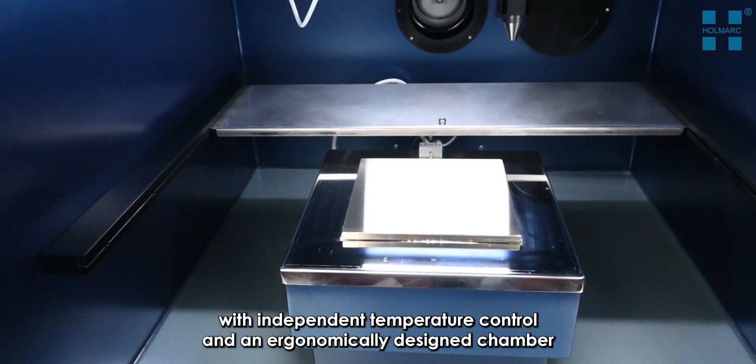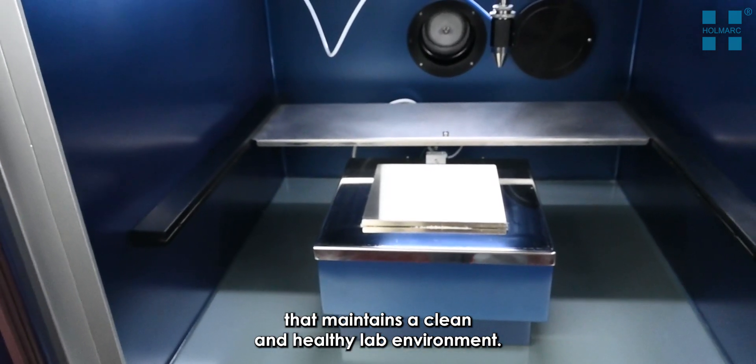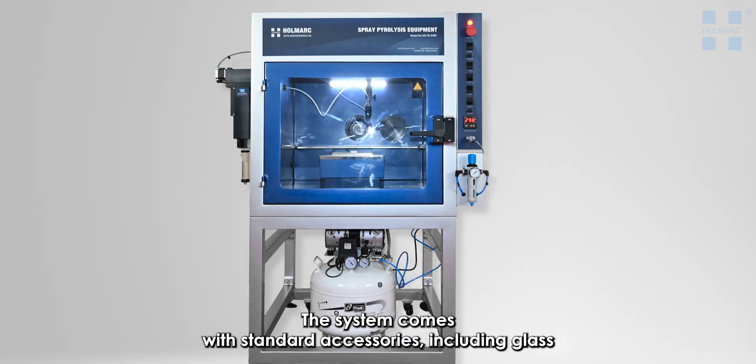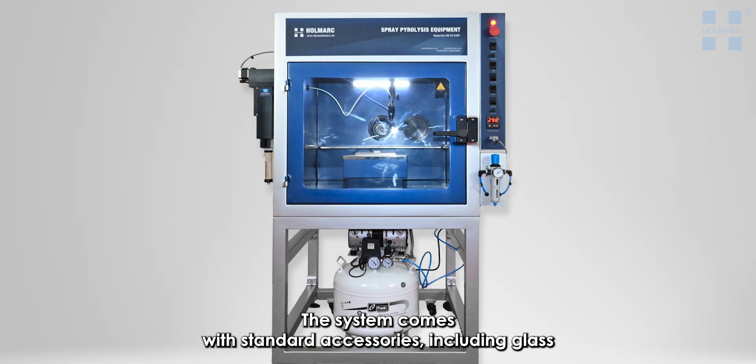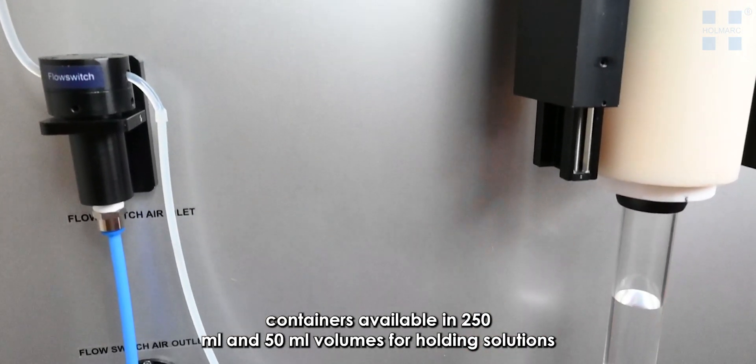The equipment includes a substrate heater plate with independent temperature control and an ergonomically designed chamber that maintains a clean and healthy lab environment. The system comes with standard accessories including glass containers available in 250 milliliter and 50 milliliter volumes for holding solutions.